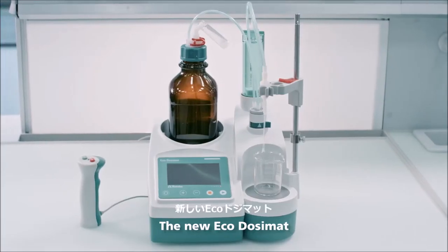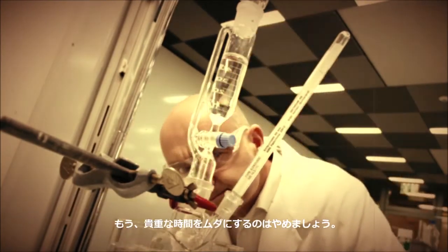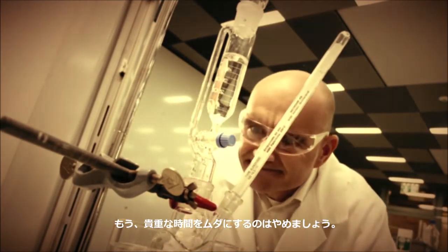The new Eco Dosimat. Don't waste your precious time any longer. Call your Metrohm sales rep now.